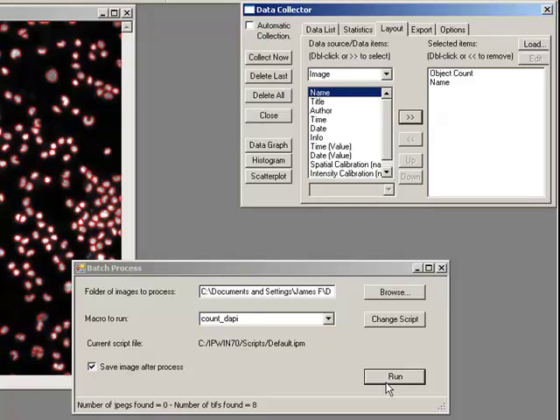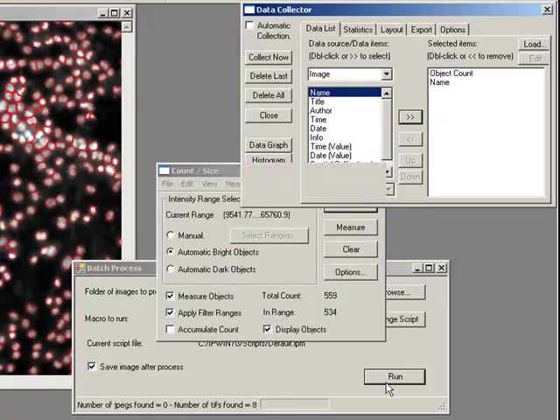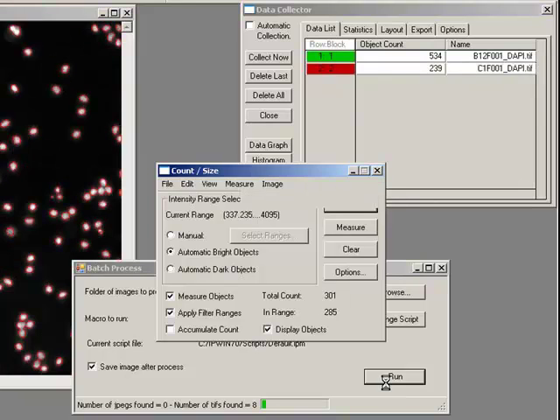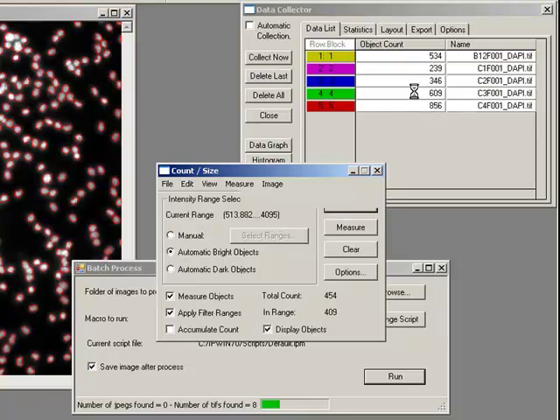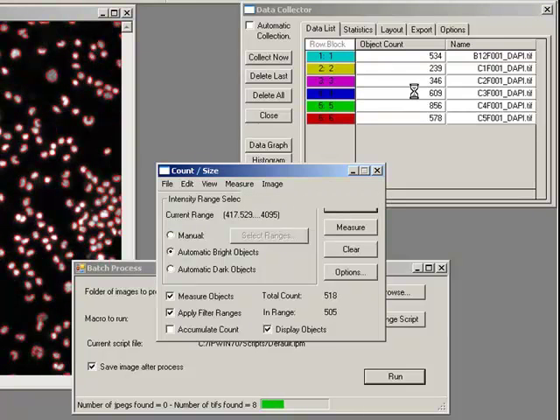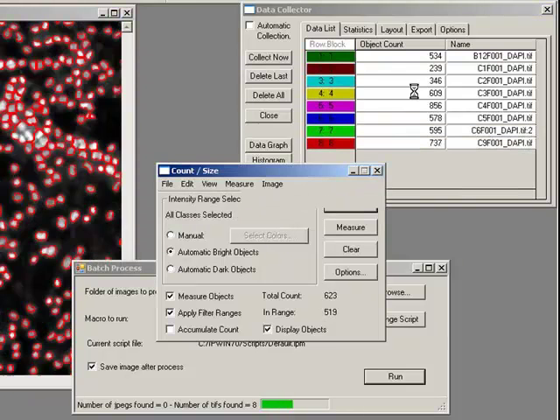So in fact, if I just run that again, only takes a few seconds, and you can see now I have the name of the image reference to the count or whatever data I want related to that. Okay, I hope that helps.